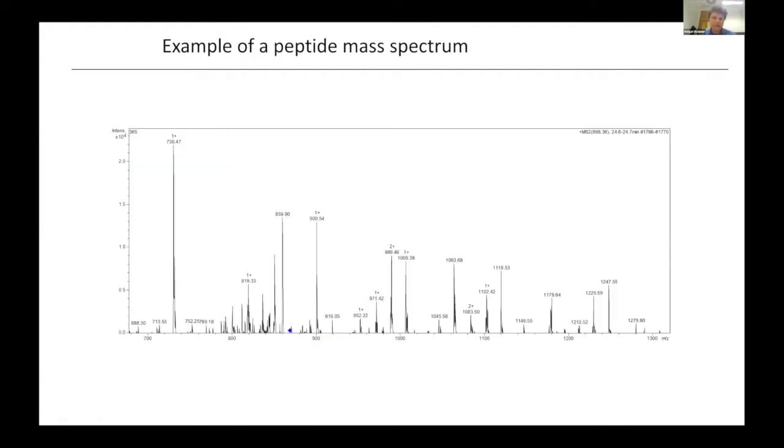I wanted to start by showing an example of a mass spectrum. If you've not come across this before, it's good to establish a few of the basics. Generally in a mass spectrum, on the x-axis, we're looking at the mass-over-charge ratio. So we're not measuring mass directly; it's the mass relative to the charge of the ion that is detected. On the y-axis, we've got an intensity, which could either be an absolute intensity, as shown here, or a relative intensity, where the whole spectrum scales to 100%, with 100% being the most intense peak in the spectrum.